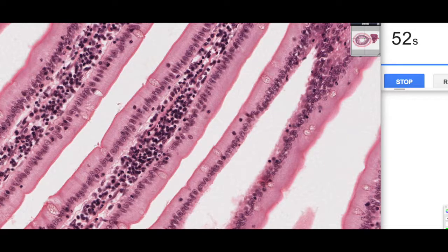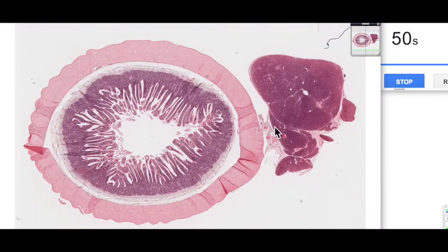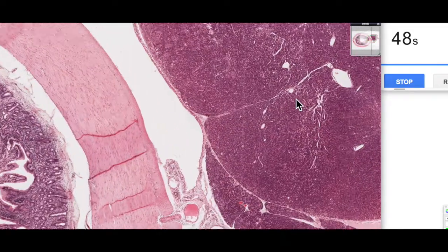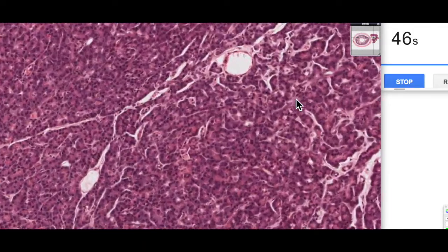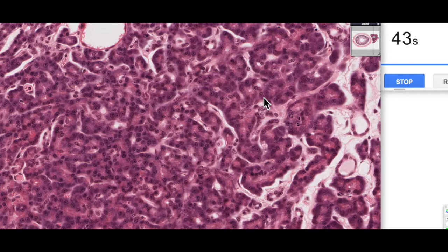So what I wanted to also point out was we'll go over to the pancreas. If we have a look at the pancreas, the pancreas is also another organ that has cells which produce lots of protein but because the different parts of the cell are performing slightly different functions, it results in a slightly different staining pattern.